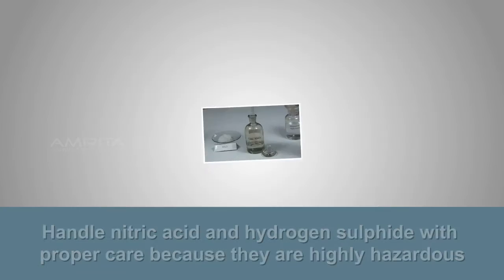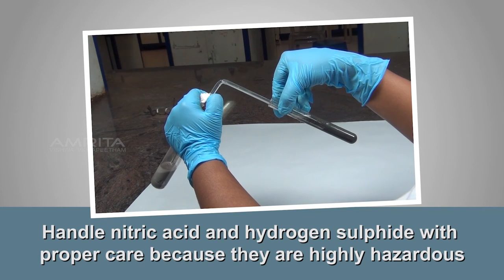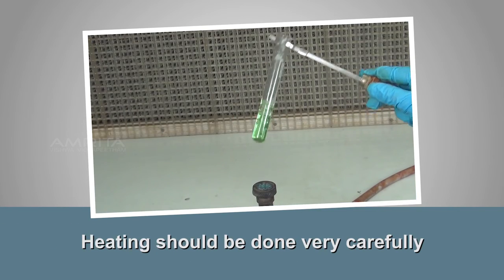Precautions: handle nitric acid and hydrogen sulfide with proper care because they are highly hazardous. Heating should be done very carefully.